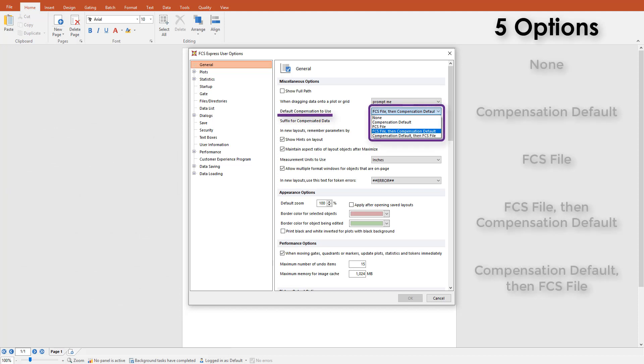There are five default options available. The first option is none. FCS Express will not read data files for compensation written at acquisition and plots will only display compensations to which you have applied them. When changing data files or batch processing, it will remain the same until you change it.